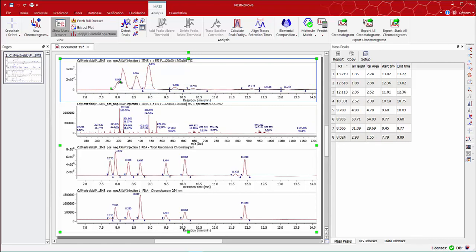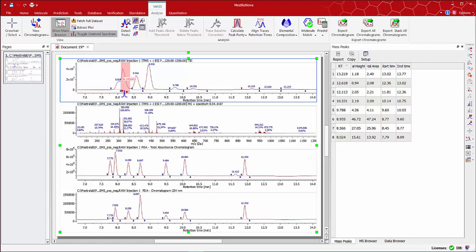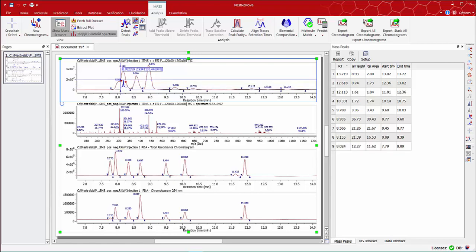For example, on this peak, by pressing and holding the SHIFT key and then drag it to the desired place. You can do the same for this other peak.